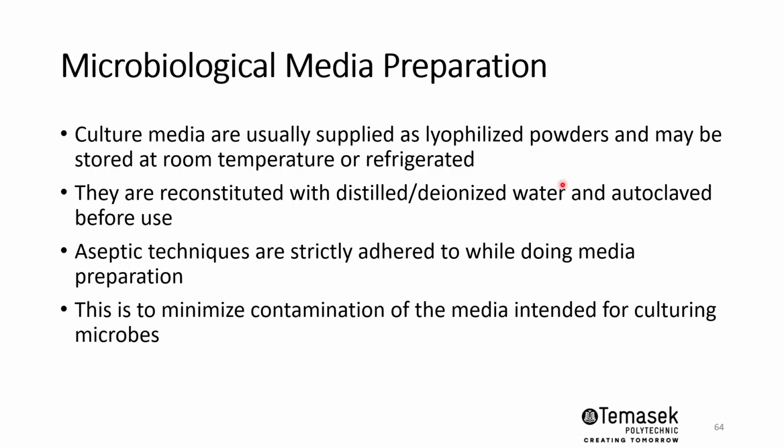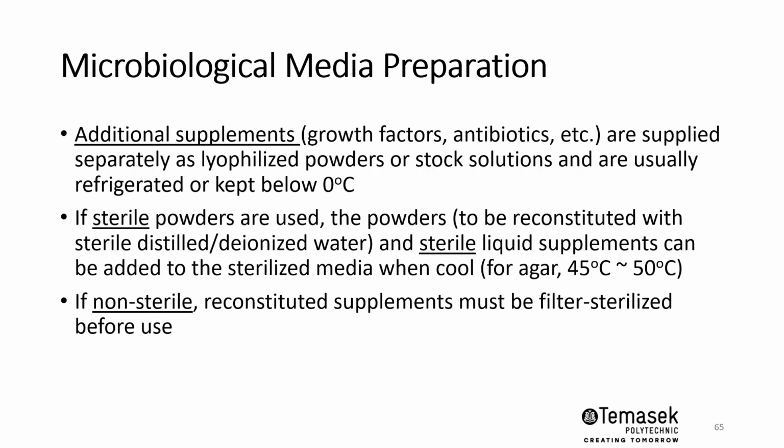So I also want to mention additional supplements. Sometimes we do add additional supplements such as growth factors or antibiotics into our culture media here. Often we can buy them commercially as lyophilized powder or stock solution. And these are usually kept refrigerated or below 0 degrees C, freezing point. Certain antibiotics are provided sterile. If these are sterile powders and the powders are eventually reconstituted with sterile water, then these sterile liquid supplements can be added directly to the sterile media when they are cool.